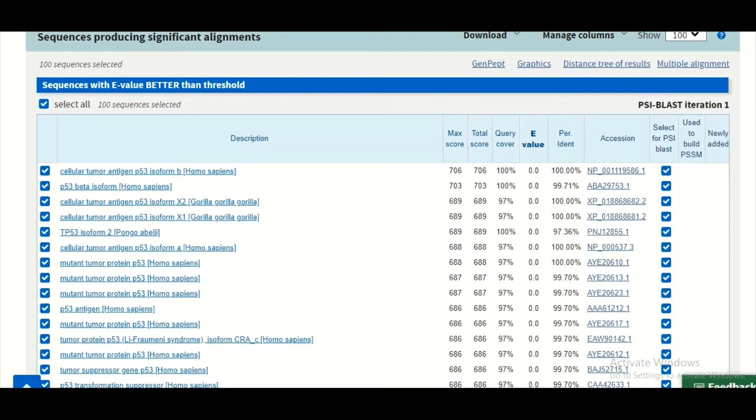it means that these results could not be your true positive values—they could be false positives, and you should be very careful to declare them a homolog of your query sequence.